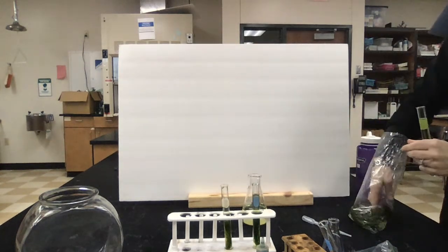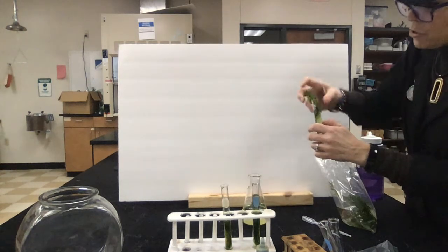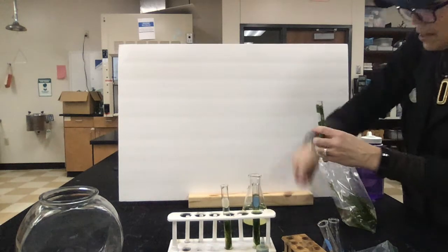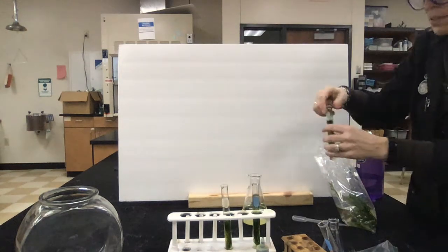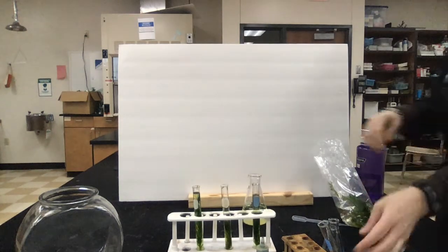And remember, there's lots of carbon dioxide in the test tube right now. And so what I'm doing is placing the plant in there. We're going to place the plant in some sunlight. And then we're going to watch it to see if it photosynthesizes.